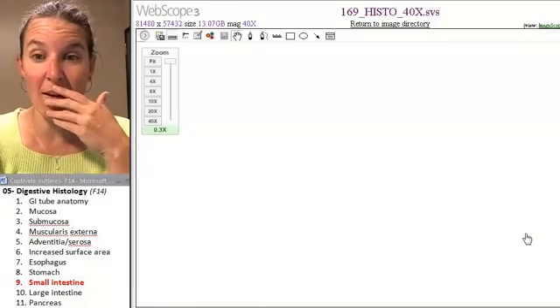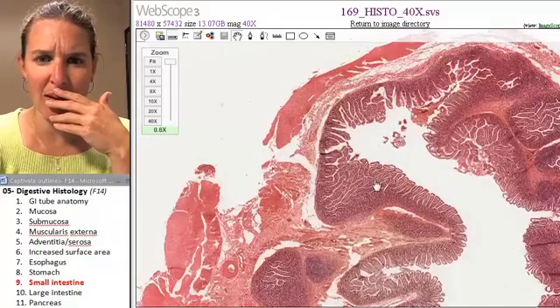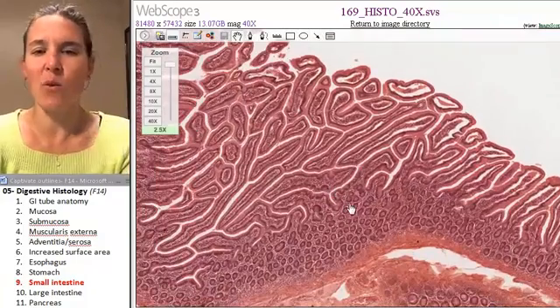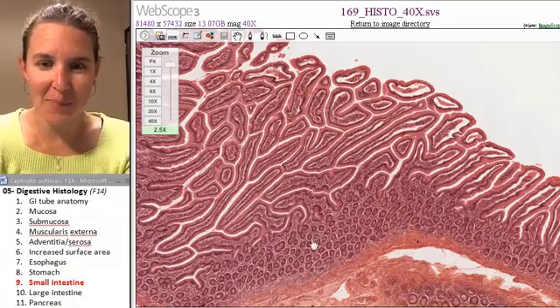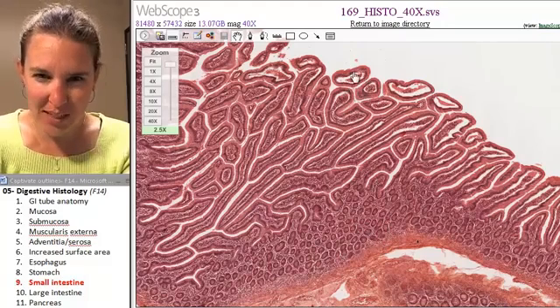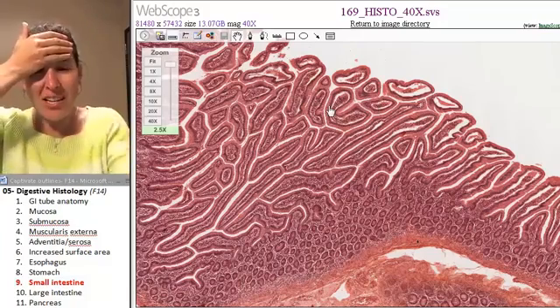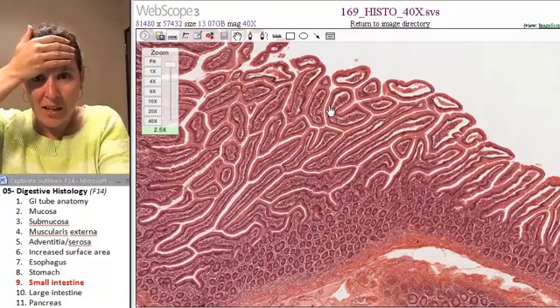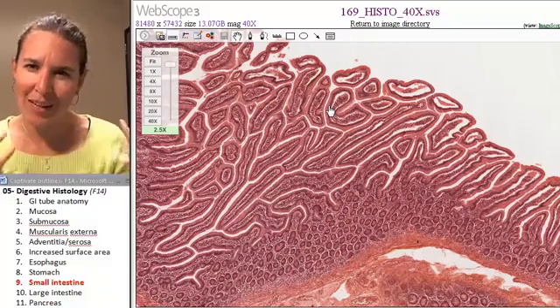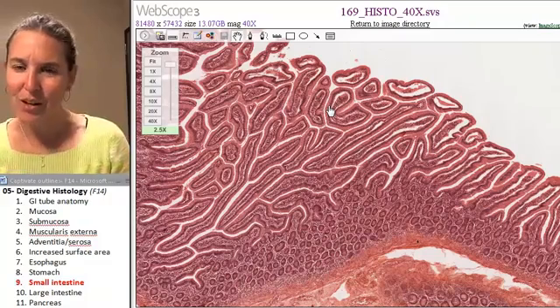This is a giant, like, what are the chances that it looks how I want to show you what it looks like? Okay, this kind of works. Does it work? Look, that's that giraffe-y looking shape that I was imagining, but it's more like in this space. That doesn't look like long, thin villi to me, but it's because we cut a slice and they were all in a tangle when we cut the slice, so we got all different kinds of angles on our tangles.